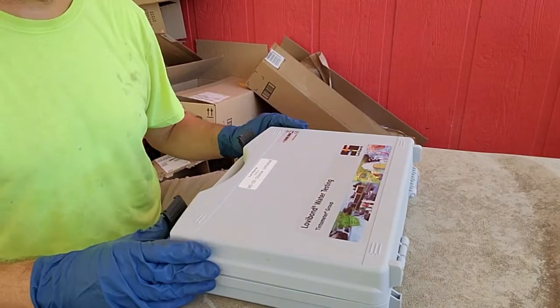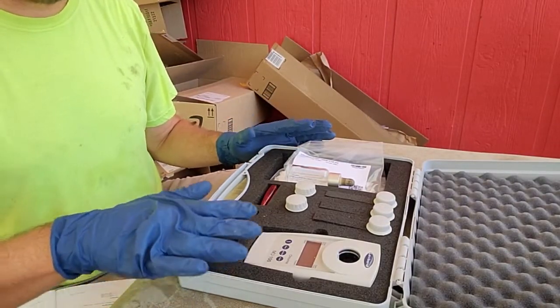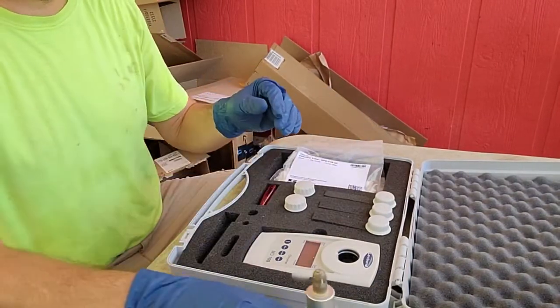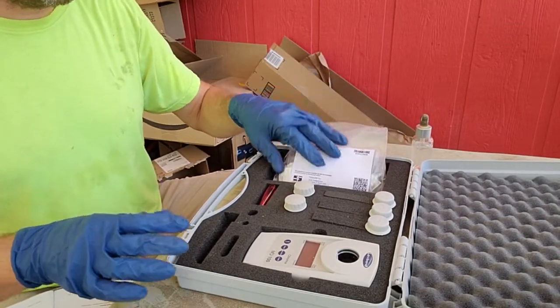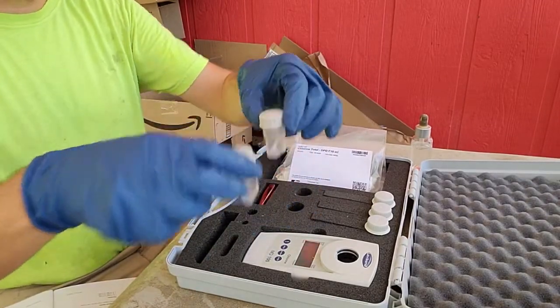This is how our new colorimeter works that we're going to use up at the wastewater treatment plant. It's a little different than the last one — it doesn't have a flappy lid; that's all taken care of by the shape of the caps. Pull out your acid drops, these are our pillows, our reagents — these are the two vials we're going to use for our testing.